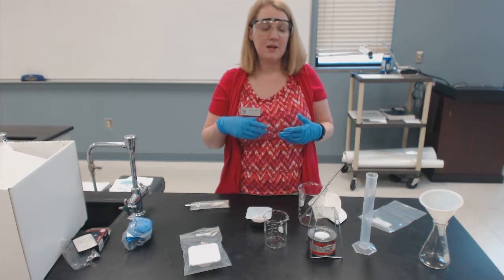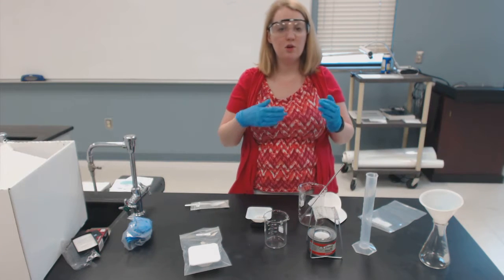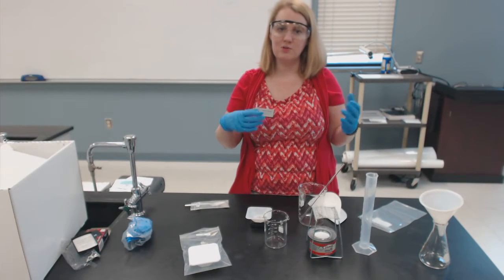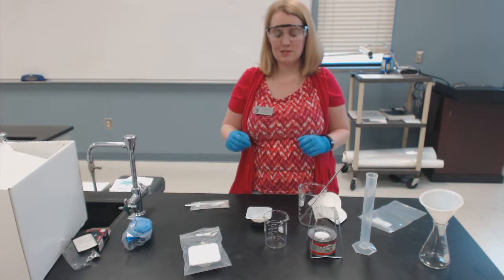a problem. Number two, rather than filling out a worksheet, you're going to be writing a full lab report on this, including your full written procedure that needs to be written in enough detail that somebody else can come along and follow and do exactly what you did. So let's first look at the things you may need to include to do this lab.